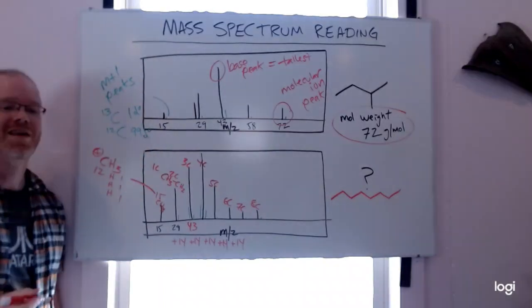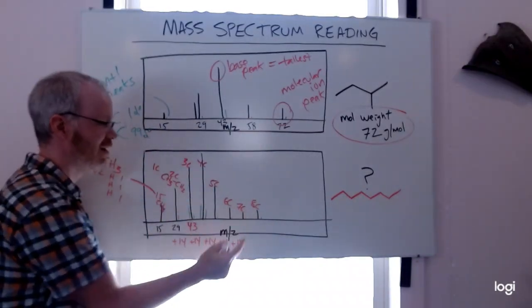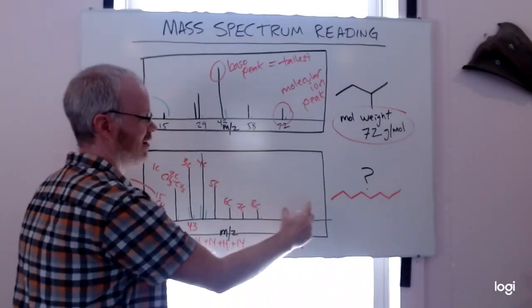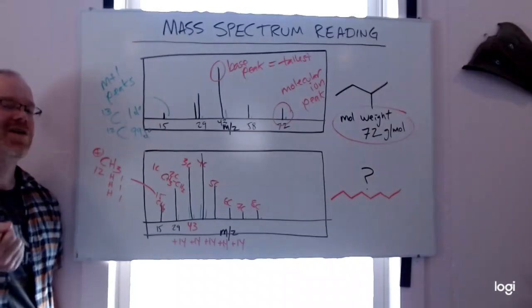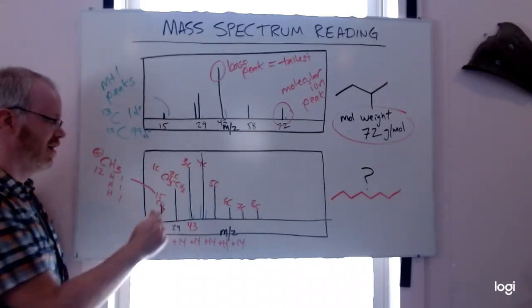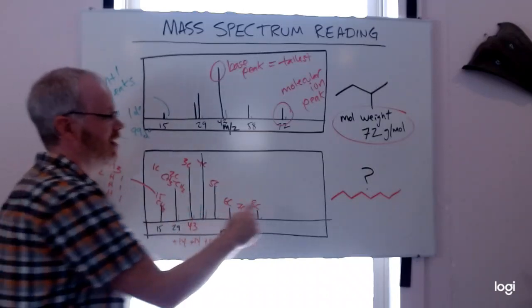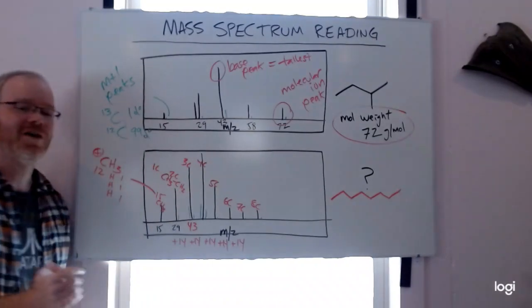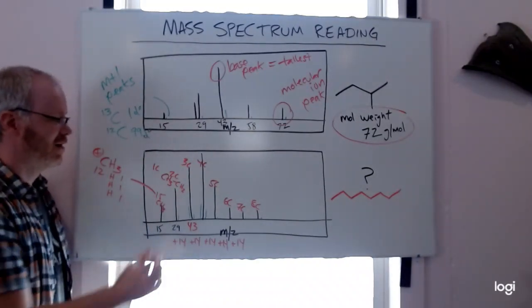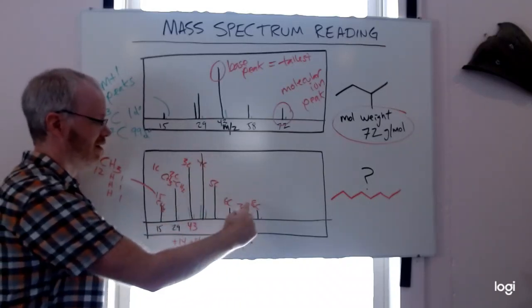And then that's a starting point. Say, okay, 1, 2, 3, 4, 5, 6, 7, 8 carbons. Maybe there's another peak out here, so there's a chlorine on the molecule and such. Of course, you still want to look at the molecular ion and think about the molecular weights of the compounds. But if you see these very regular patterns, it can help you find that hydrocarbon structure. That can be the whole molecule, or it could just be part of it. It tends to have this distinctive pattern, and the peaks tend to rise and come back down.